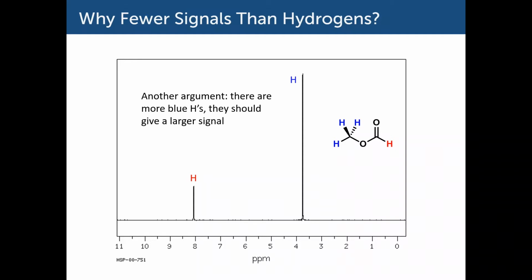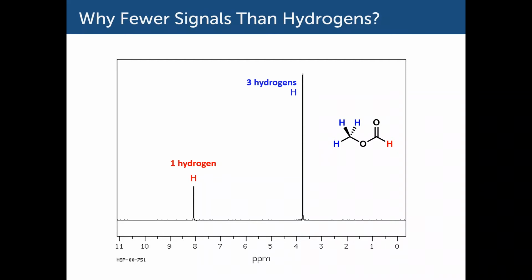If you were to do a little bit of calculus and not measure the height of the peaks, which turns out not to be very reliable, but rather the area under them, essentially the area under the curve that is these peaks, and that's sounding a little familiar already, that will correspond to essentially the number of hydrogens giving that signal. As we'll see later in this video, that's not exactly what an integration value means, but that's more or less the information we gain from these so-called integration values.